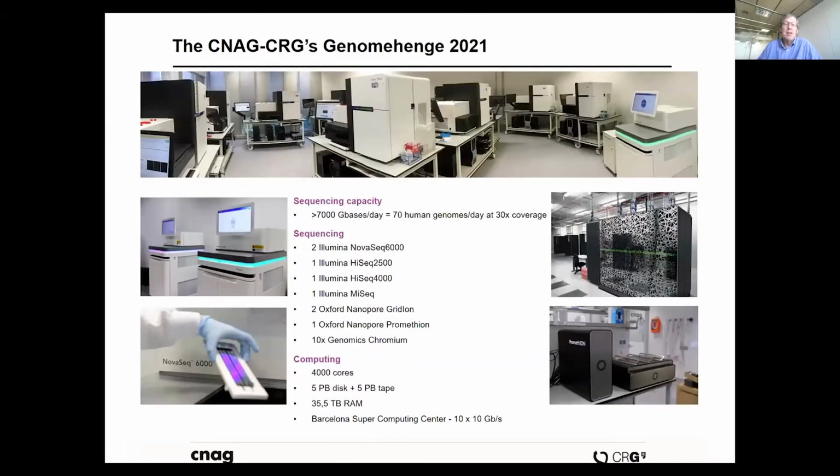A quick skip over this. Marta is going to show more about this in a minute. We have a whole bunch of sequencers, and we have a whole bunch of computers, and we put these two things together to do our work. So we do sequence analysis and we do interpretation of the data that we generate on our sequences.